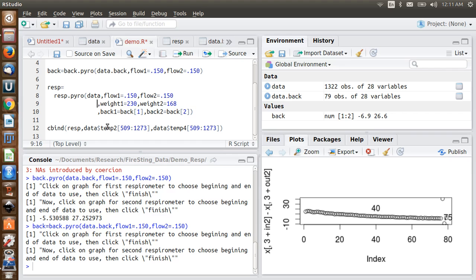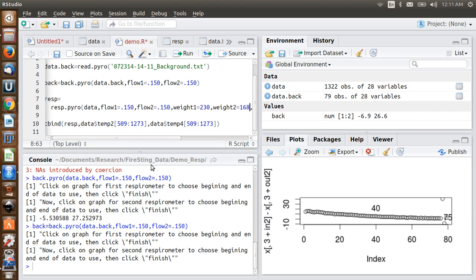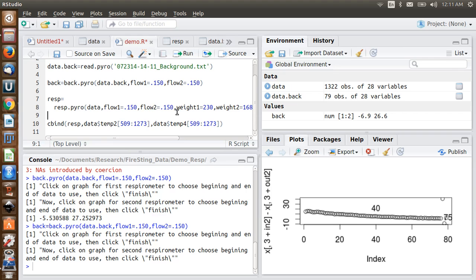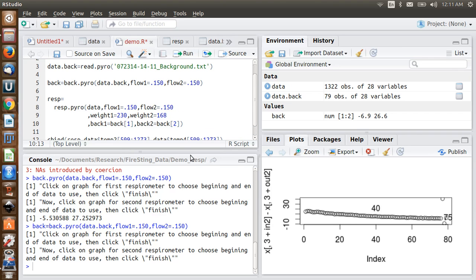Now, what you want to do is, no, excuse me, let me back up. You'll notice I have this on several different lines. This is the same as writing the function on one line. I just did this to make it easier to follow. If I make this entire function on one line, I don't really do anything differently than what we had done before. I'm just breaking this up into multiple lines, and that runs exactly the same as if it was all on one line.